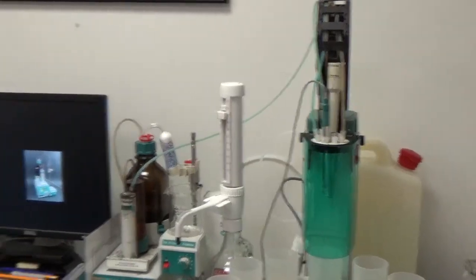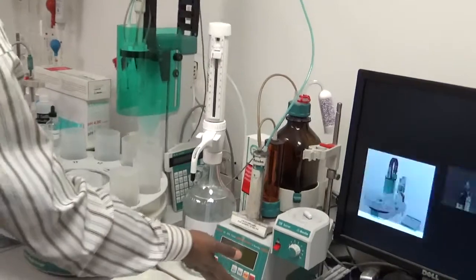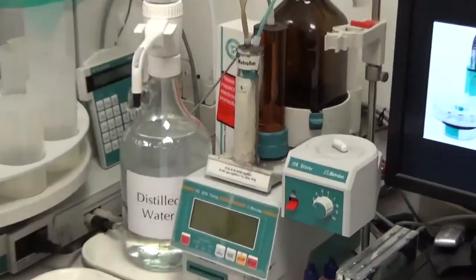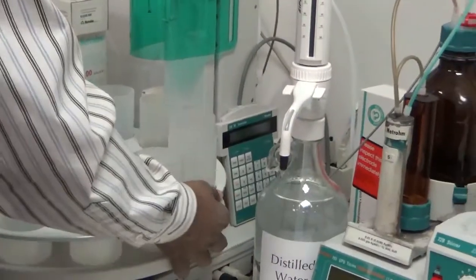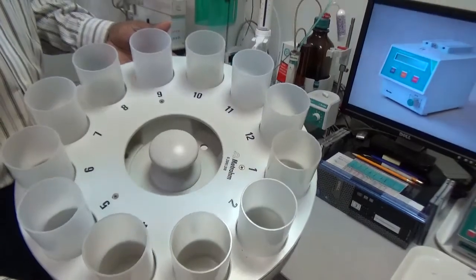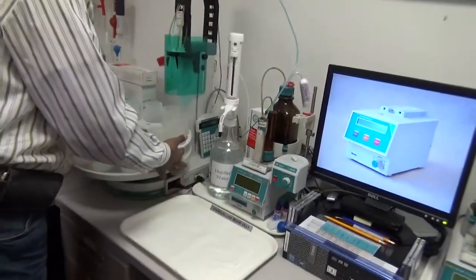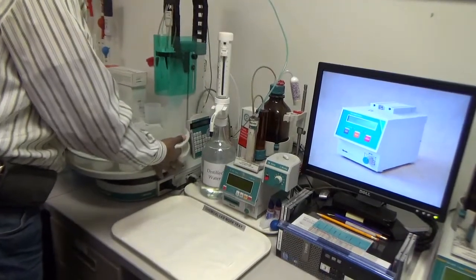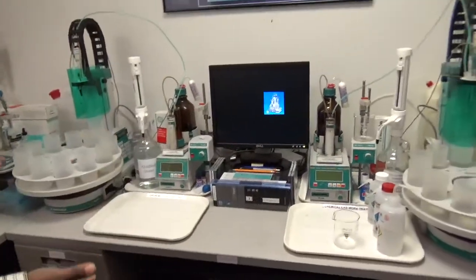We have exactly the same setup on both workstations — another 751 Titrino and 730 sample changer with a 12-position rack and 12 beakers. We can do up to 10 to 11 samples per set per rack. Using two workstations side by side, from 20 to 22 samples can be analyzed at one time, unattended and automatically.